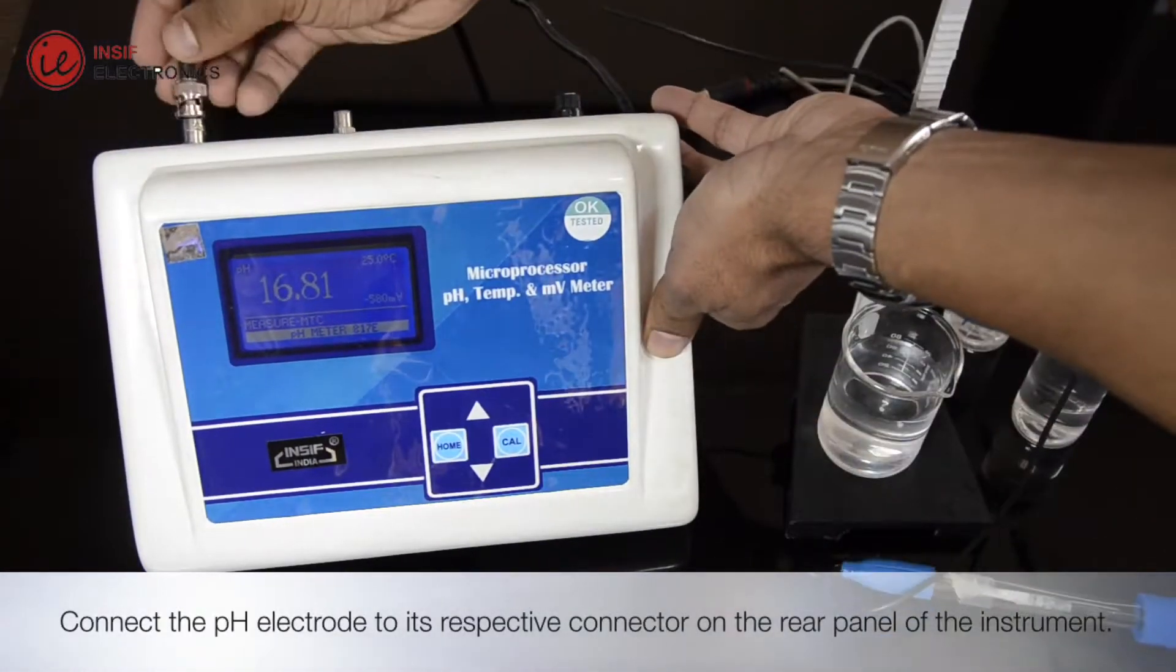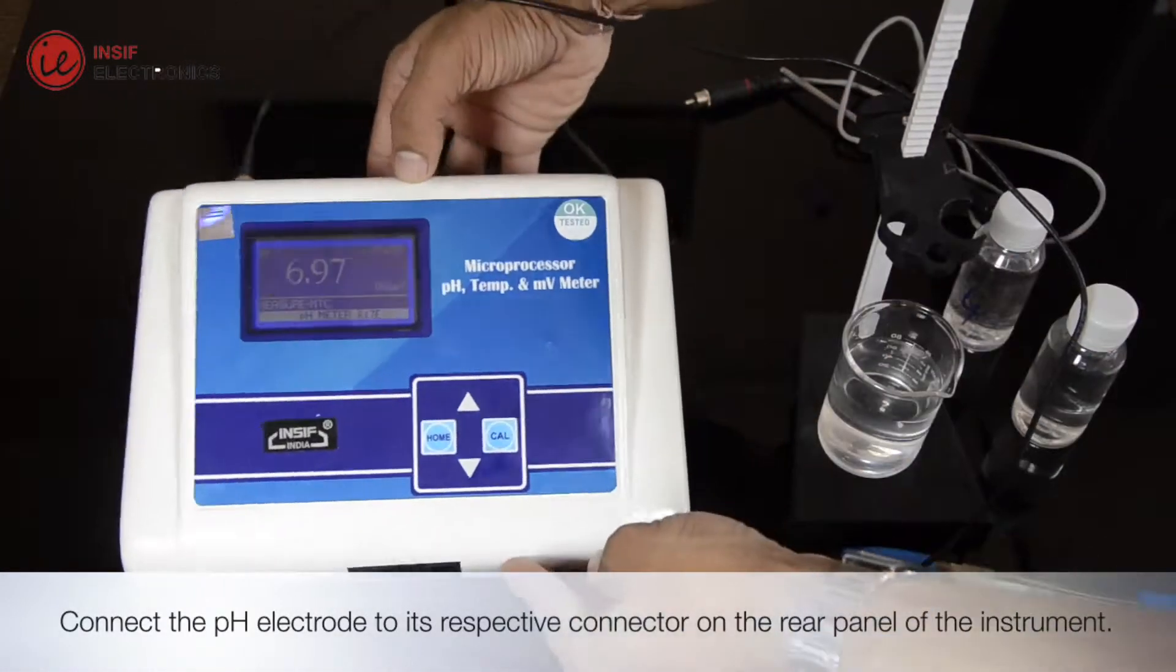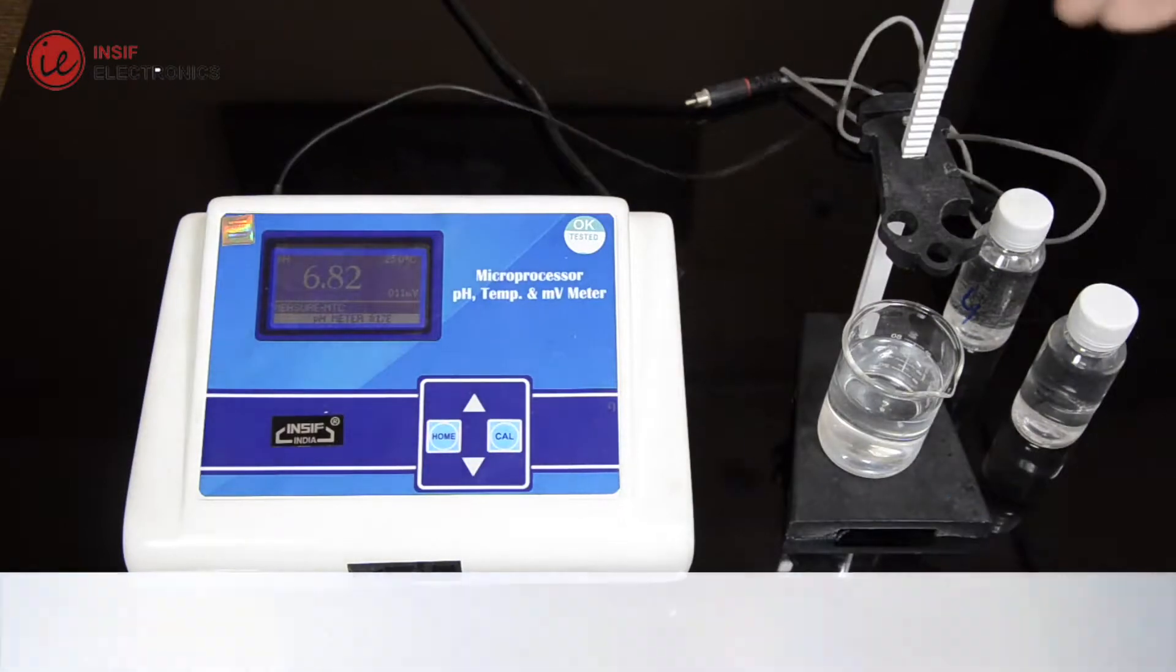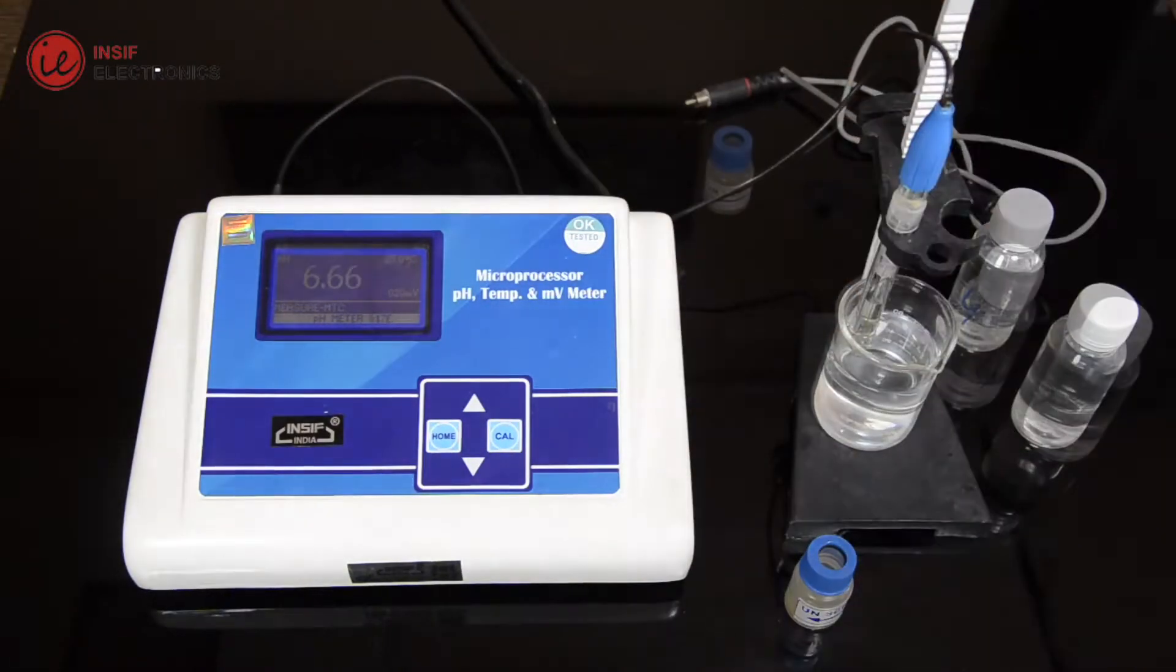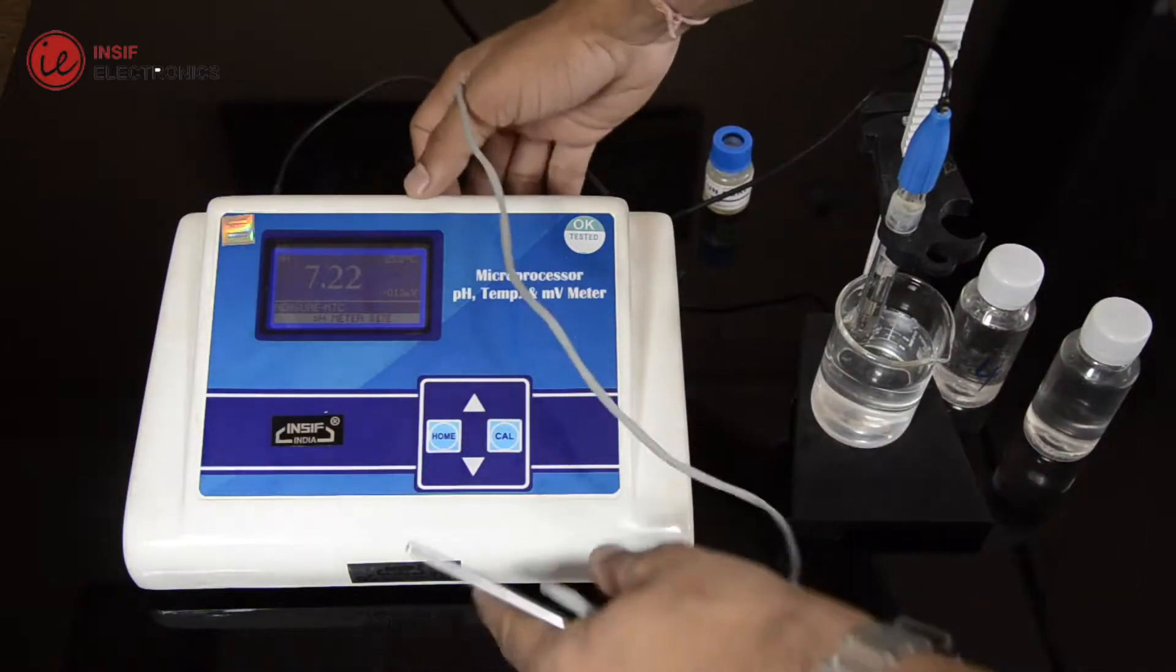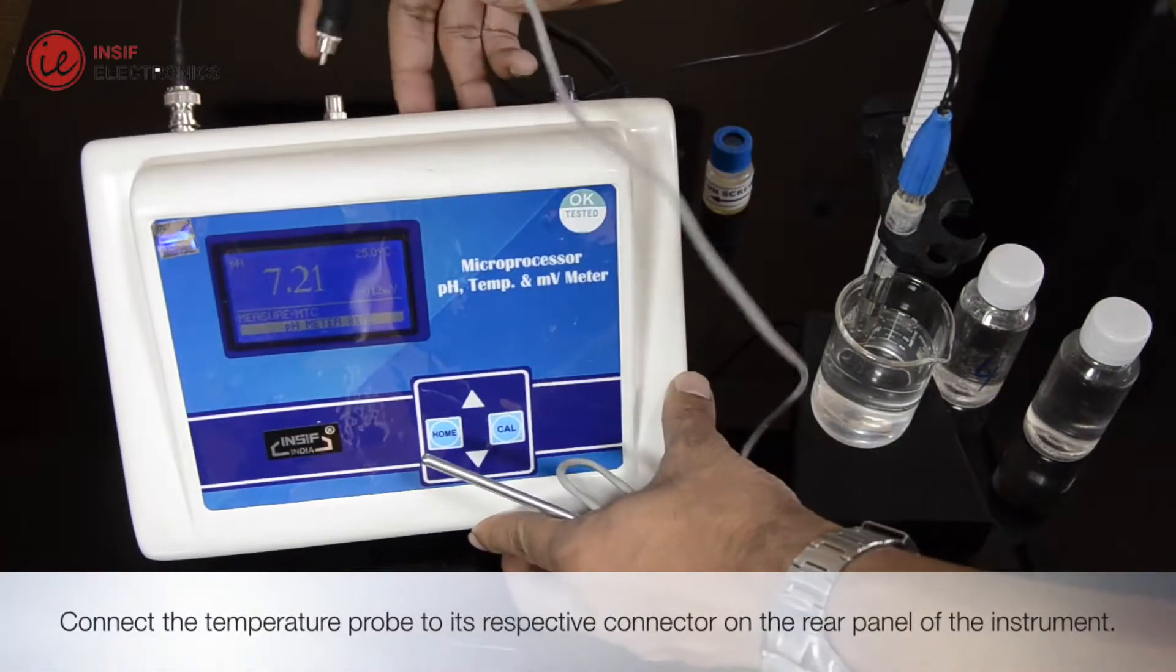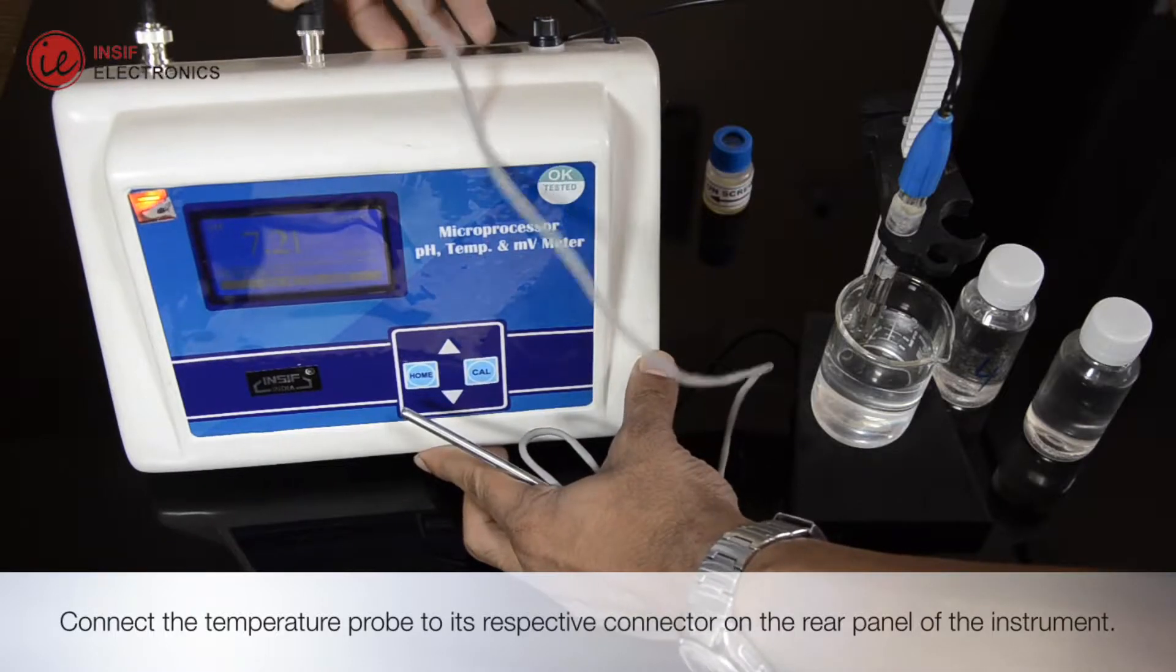Connect the pH electrode to its respective connector on the rear panel of the instrument. Connect the temperature probe to its respective connector on the rear panel of the instrument.